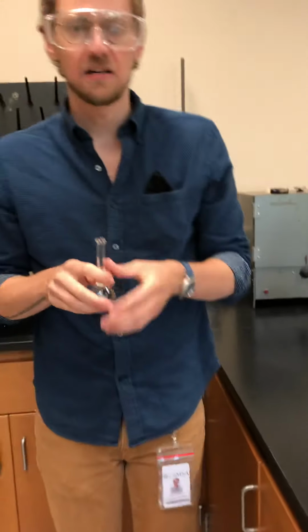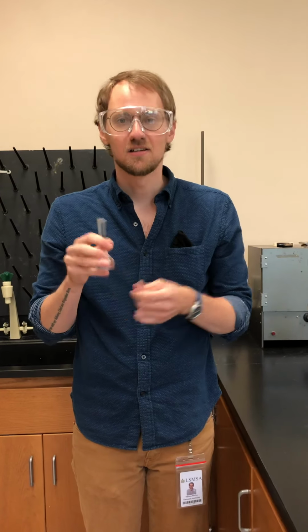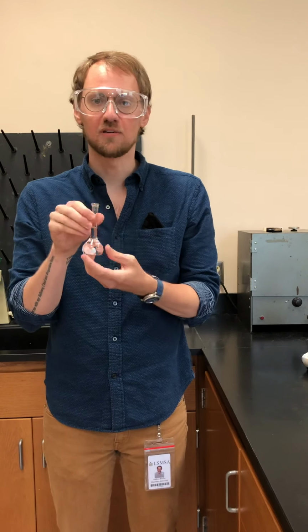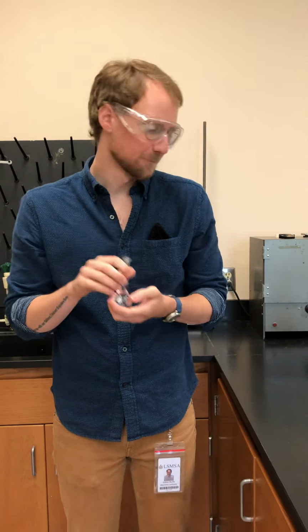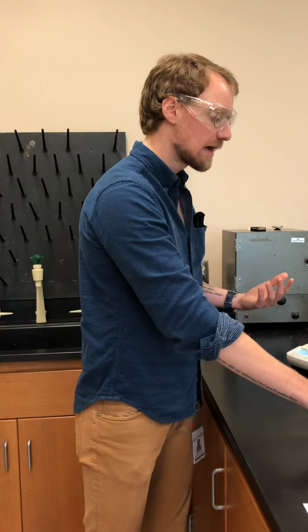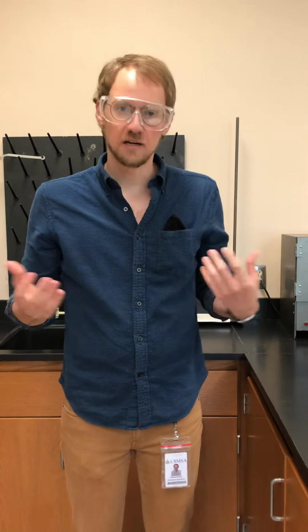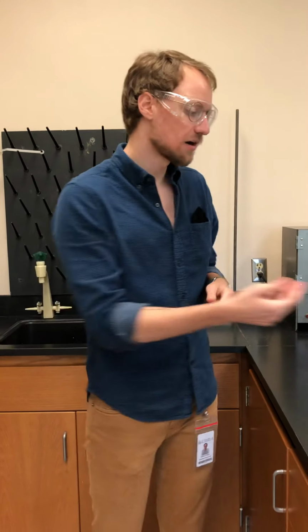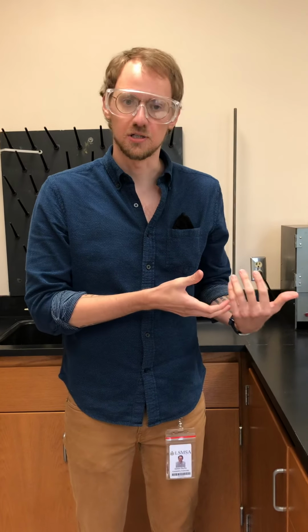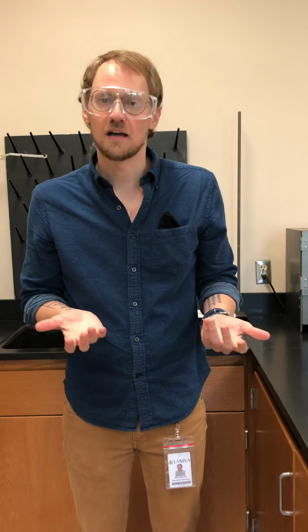So now we have the mass of the empty flask and the mass of the filled flask. You can subtract those two to get your mass. You know the volume because it's a 25 milliliter volumetric flask. We don't have to measure the temperature of this solution because we're in the same lab. When we measured the temperature of the water, everything's equilibrated to the same temperature, right? So the temperature of our unknown solution will be the same as our water solution. So we're not going to measure the temperature again because we already did that in the last video.